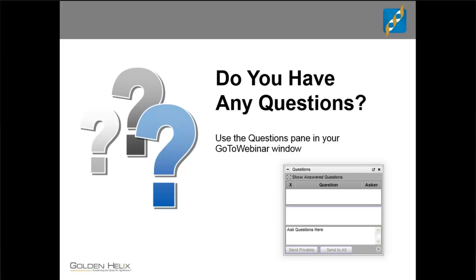Right, so the algorithms are obviously going to be very flexible, but what you're starting with in that project is just a starting point, and you can use that to customize your own trio workflow or build a completely new one from scratch. Any project is something that can be turned into one of these templates, essentially recording all of those steps that you did to create it, so that when you create a new project from the template with new sets of samples, all of those steps, all of those filters, and all of those view preferences are applied.